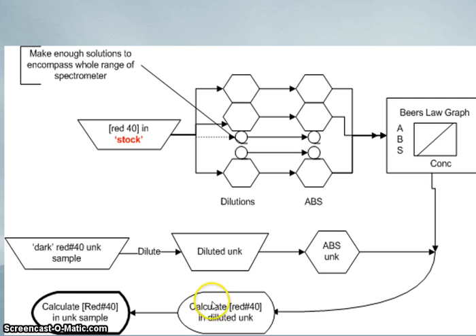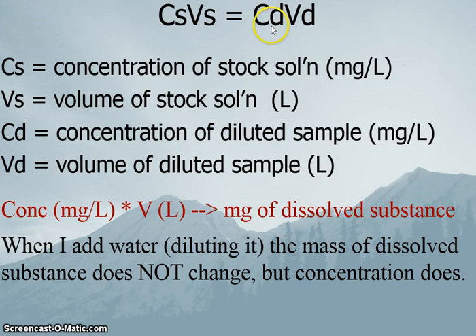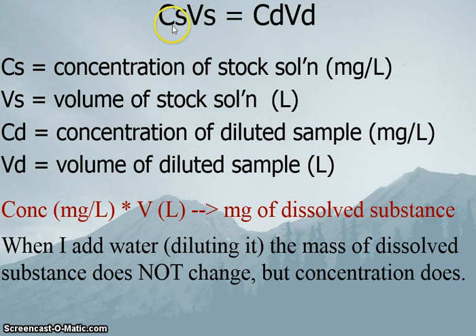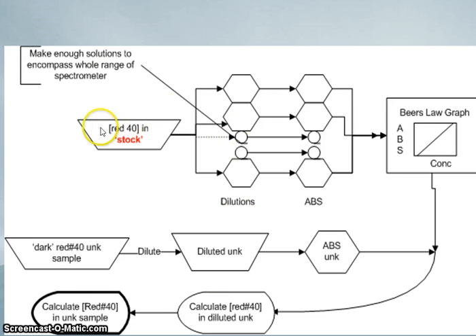But our goal is to calculate the concentration of Red Number 40 in the original sample. We know the concentration of the diluted unknown and are trying to calculate the concentration of the undiluted unknown — so we use the same dilution formula. The concentration of the dilute was our diluted sample; we know the volume of the soda we put in and what we diluted it to, so in this second part we are back-calculating the concentration of the stock soda solution.